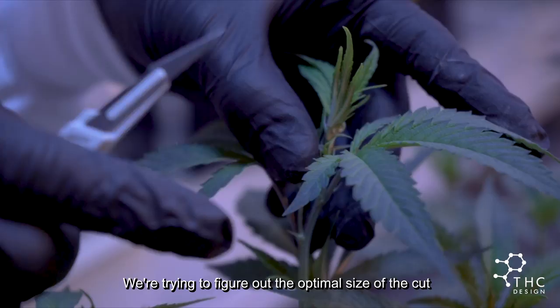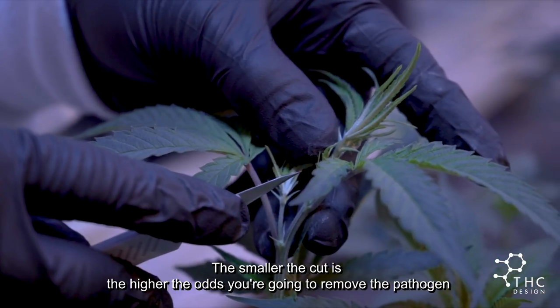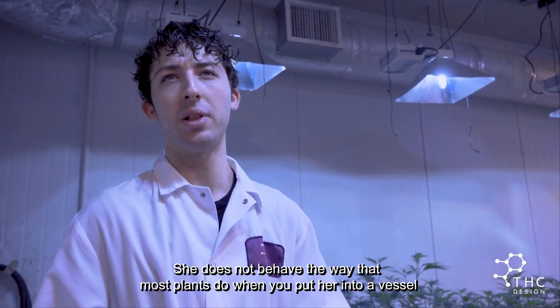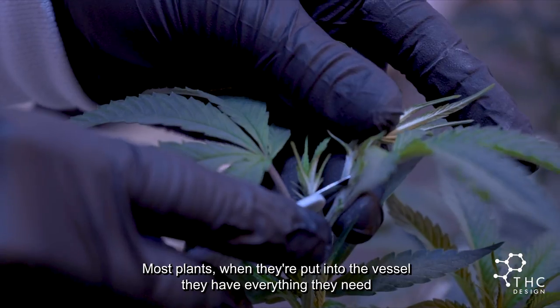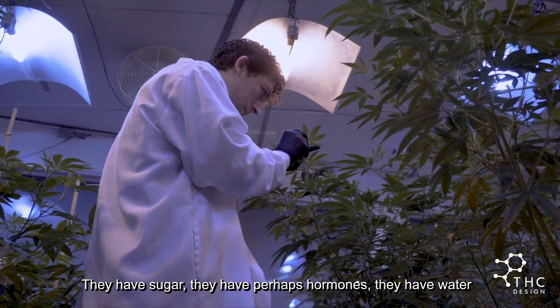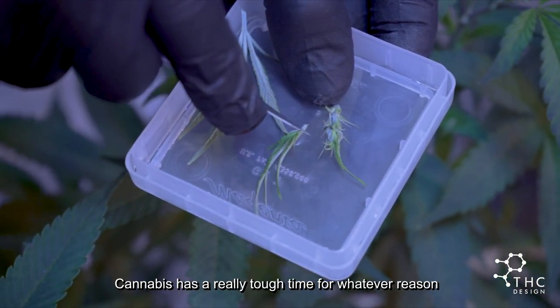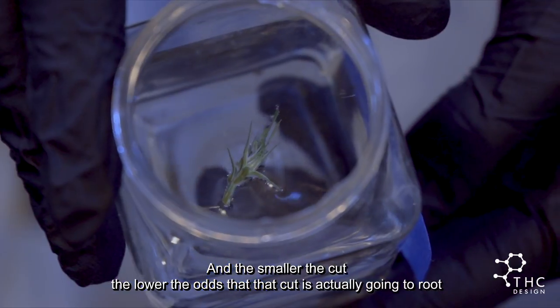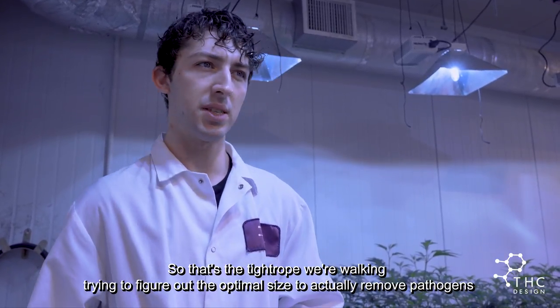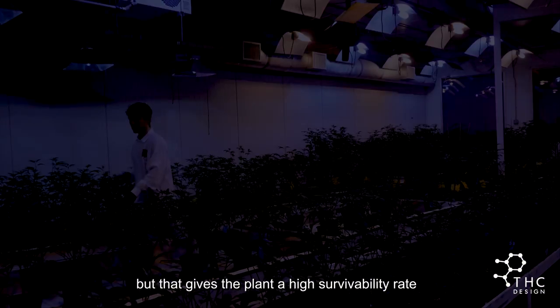We're trying to figure out the optimal size of the cut. The smaller the cut is, the higher the odds you're going to remove a pathogen. But cannabis is finicky — she does not behave the way that most plants do when you put her into a vessel. Most plants, when put in the vessel, have everything they need: sugar, hormones, water. They'll blow up in that vessel. Cannabis has a really tough time, and the smaller the cut, the lower the odds that it's actually going to root. The cut needs to be small to remove the virus or fungus — so that's the tightrope we're walking, trying to find the optimal size to remove pathogens while giving the plant a high survivability rate.